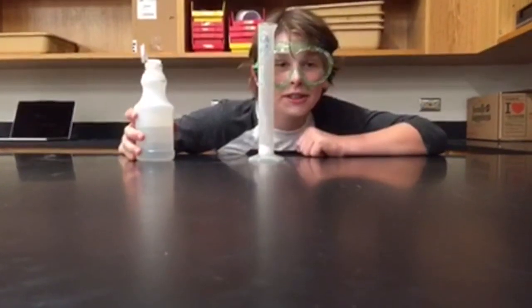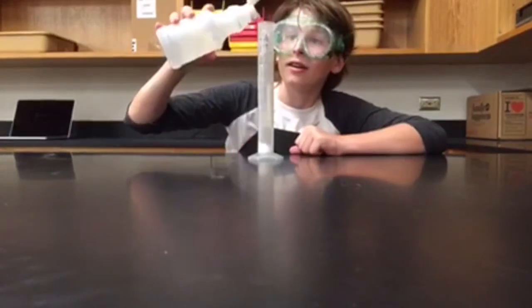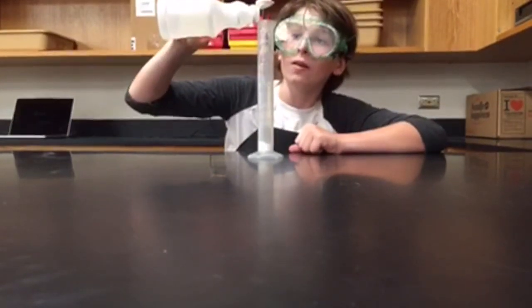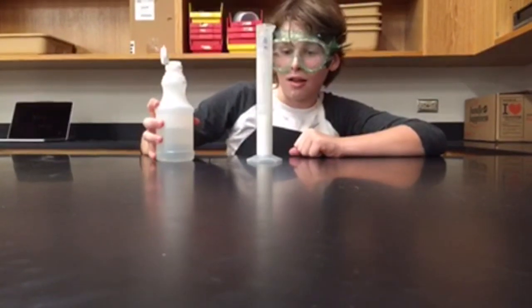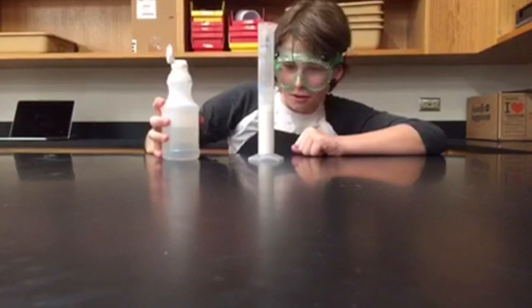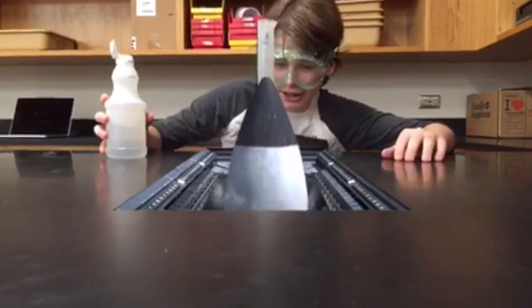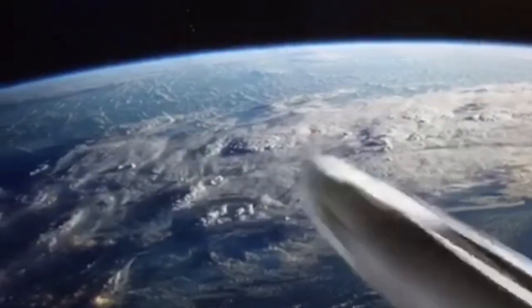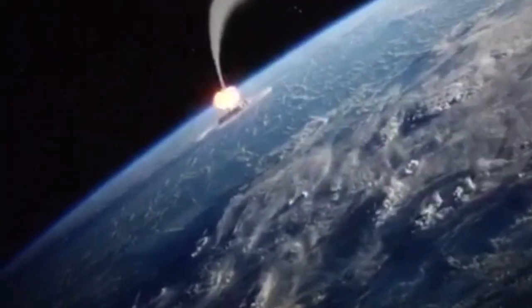Well, now that I know how to use a graduated cylinder, I guess I can give this one a try again. Wow. Wow, uh oh. Not again. Wow.